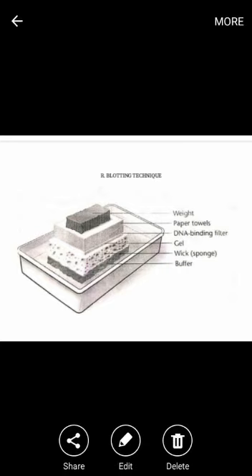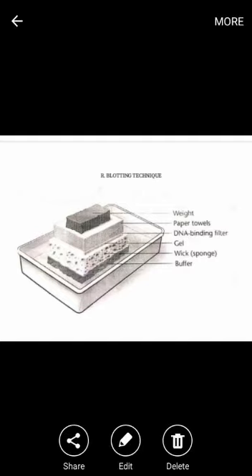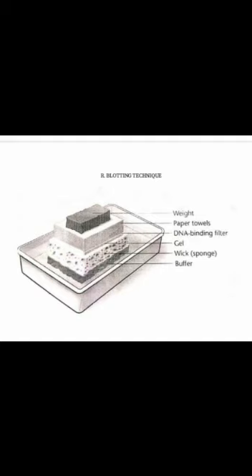And northern blotting technique is widely used to find gene expression and regulation of specific genes. For example, if we find a human insulin-like gene in oyster, then by isolating and immobilizing RNA and blotting it with an insulin probe, we can tell whether the gene is expressing or not.